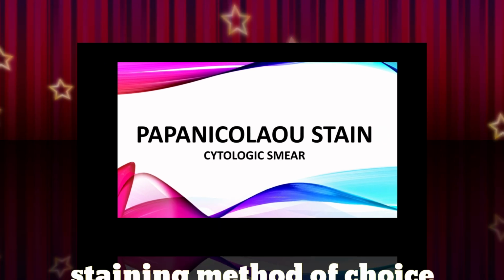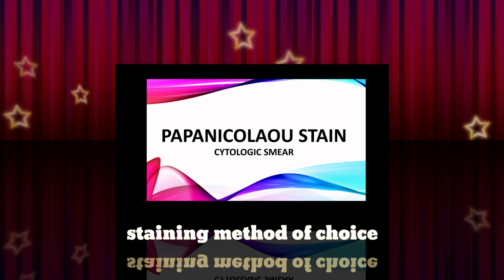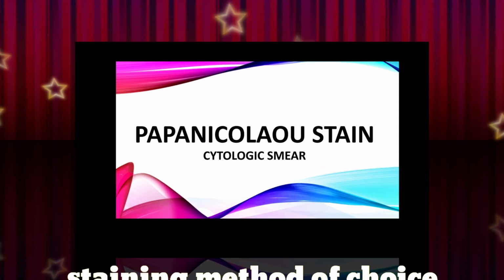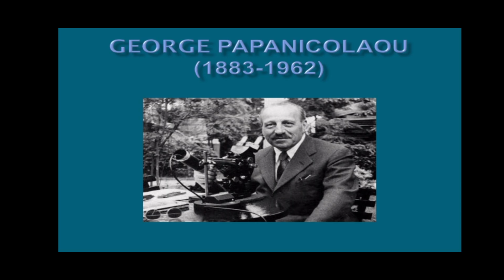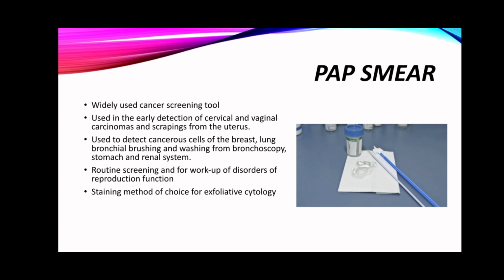To date, class, Papanicolaou or Pap smear is considered to be the staining method of choice for exfoliative cytology. The diagnosis of malignancy by microscopic examination of a group of isolated cells has been advocated by Dr. George Nicholas Papanicolaou, who, while examining vaginal secretions from rodents and human subjects in an effort to correlate cellular patterns with the sexual cycle, developed a staining method which identified stages in the maturation of exfoliated squamous epithelial cells and in effect was able to formulate a method with which malignant cells could be identified.